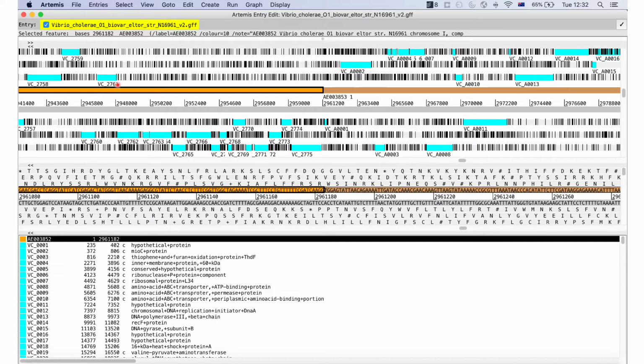So it's an open reading frame, an ORF. And Prokka, the annotation tool, has a couple of different steps. It first looks for open reading frames, and then it searches within each of those open reading frames against databases to look for sequence similarity with coding sequences. And then it makes its best prediction about which ones are real and what they are actually coding for.